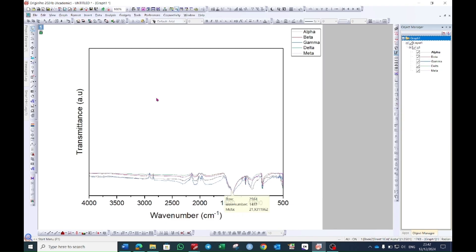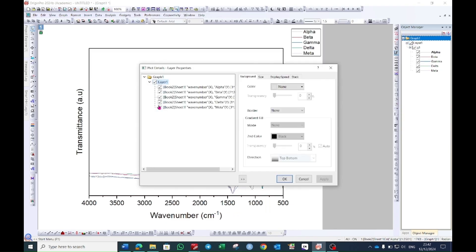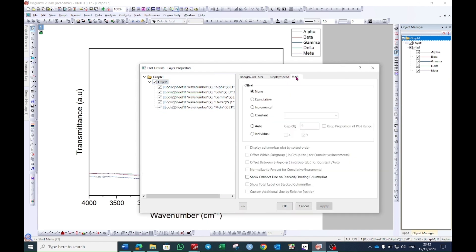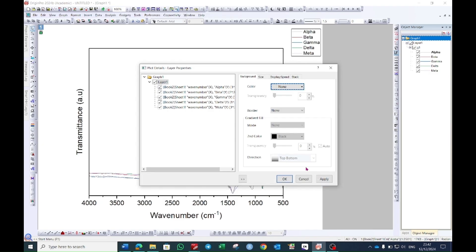Now double click here in this blank area. You will see a window will pop up with layer properties. Go to the stack option and here you will see individual. Select this one and make sure that y is selected. Then press ok.